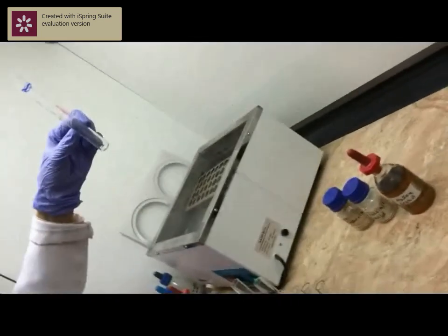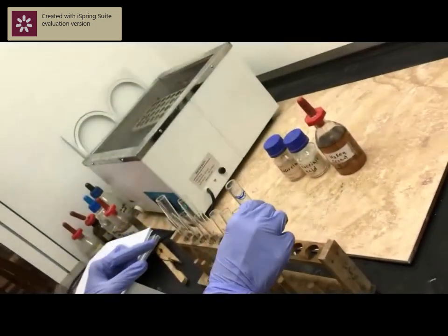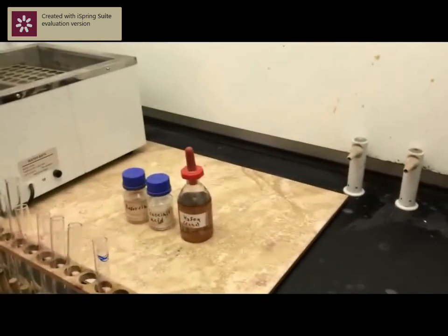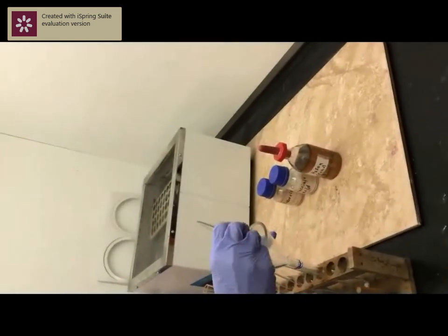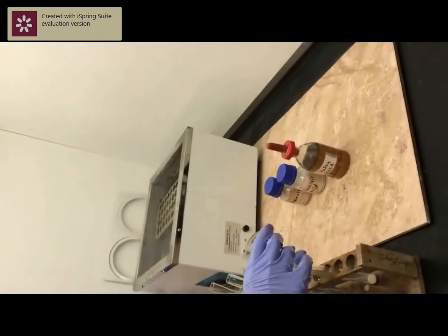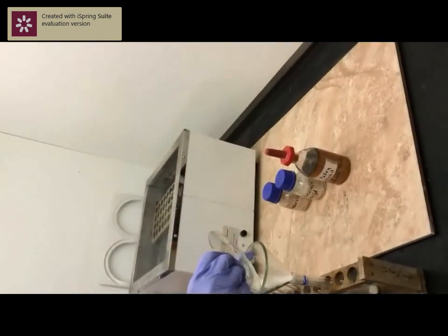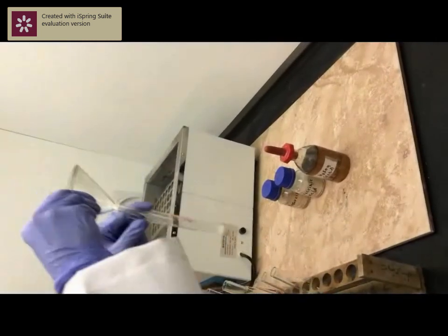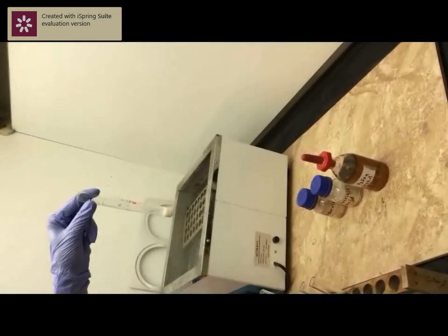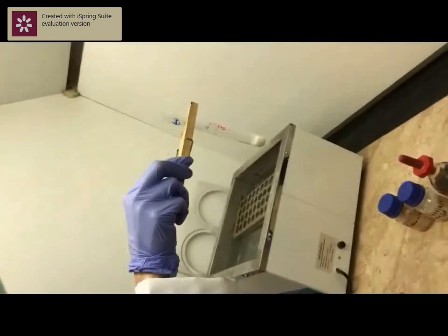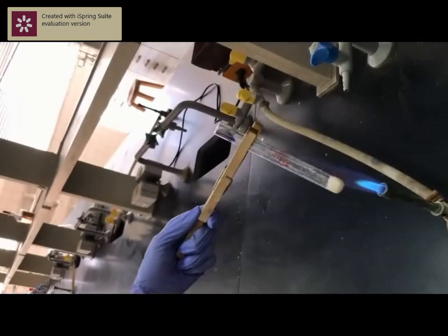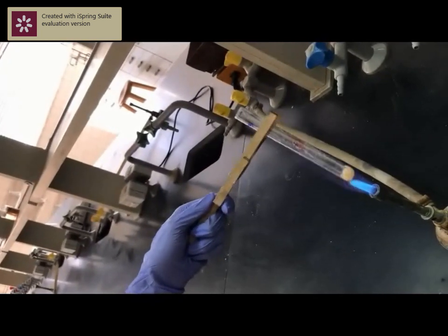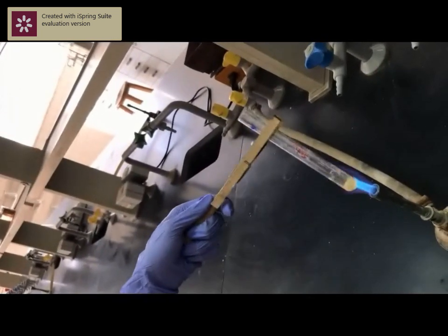Start with a totally dry test tube and add equal volumes of resorcinol and succinic acid, about 0.5 g from both of them. Now we will fuse them together using a flame, fusing resorcinol and succinic acid together until totally fused.